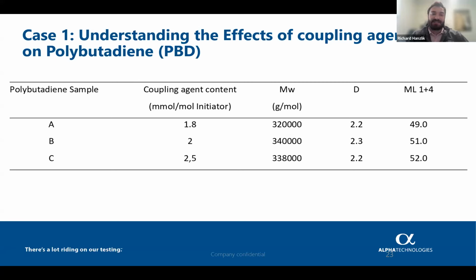We see the effects on the molecular weight. We see the effects on the ML 1+4. So in the scheme of things, not particularly different from one another. But when we look at the LAOS plots, it will be a little bit more informative.